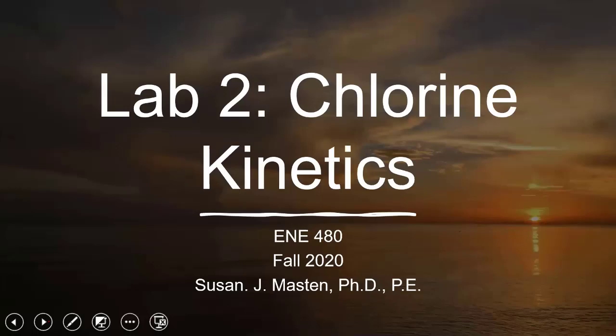So what I want to do today is we're going to look at Lab 2. Lab 2 is a kinetics lab. So we'll go through what you will need to do in order for that lab write-up, and then how you will analyze it. You will submit Lab 2 as an individual. So there's no group work for Lab 2.